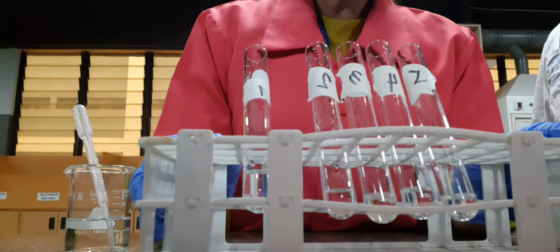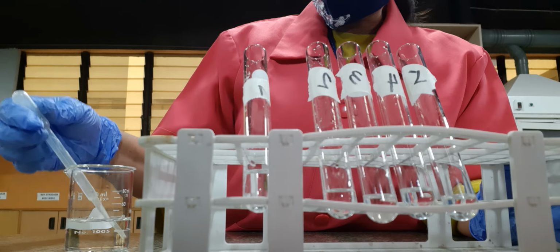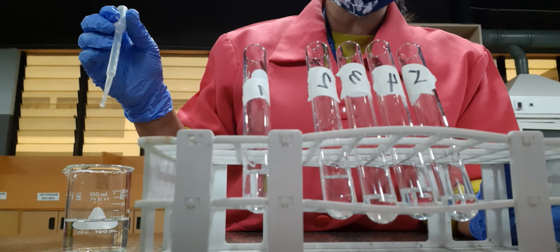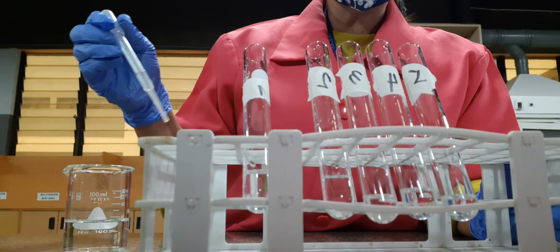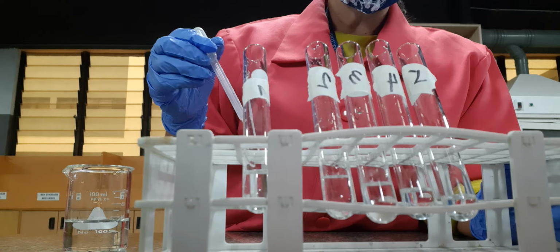So we have here our formaldehyde and water. And then the next one is acetaldehyde and water. Take note of the color. And then we also have the acetone and water.